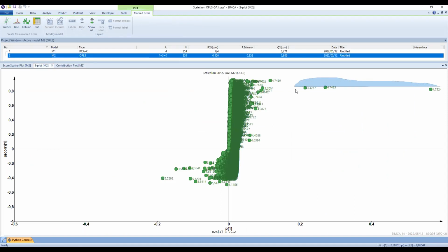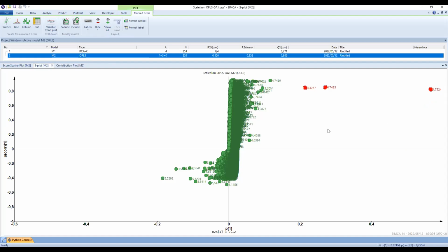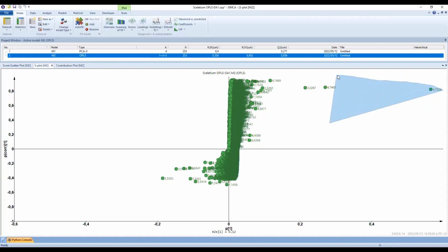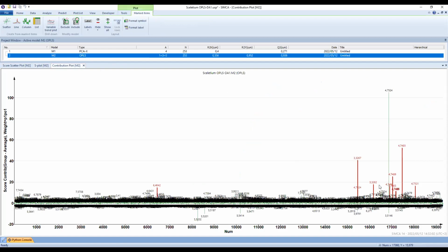So the plots are interactive. If you highlight these variables here in your contribution plot, they'll also be highlighted. So if you go in and then you put some variables that are high risk, for instance, and then you go in and then you take all of that, your contribution plot will likely show you that, okay, these variables have a low contribution, perhaps you shouldn't pick them and you need to pick this one. Okay, so that's just a plot that we also use to confirm.